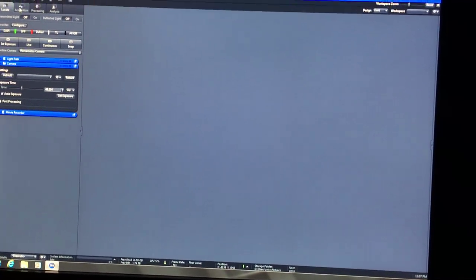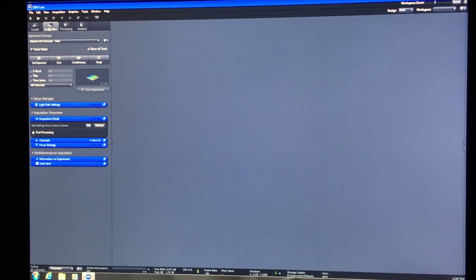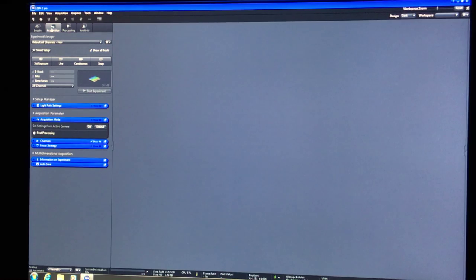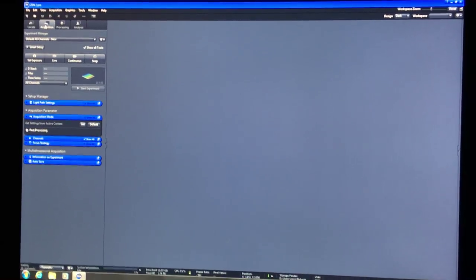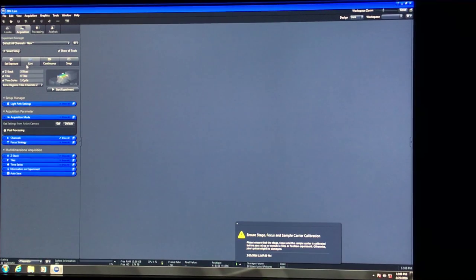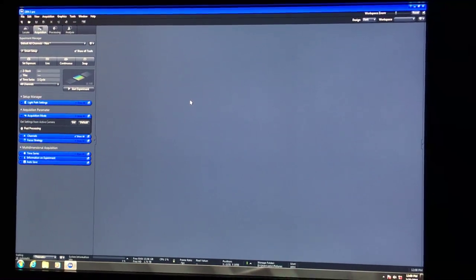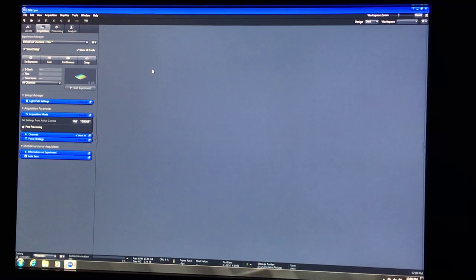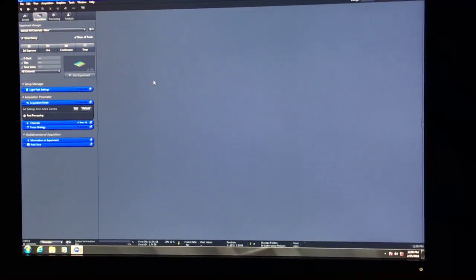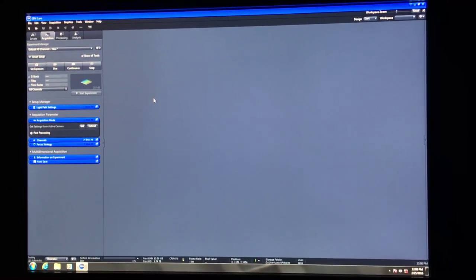Now go to acquisition—this is where the magic happens. The acquisition tab lets you program what you want the microscope to do for you. For today, we're going to learn how to do three-color imaging on a fluorescent sample, because that's the basic. If you know how to do that, everything else is just a matter of checking a checkbox. We may touch on time series since you're trying to do live cell, but at least by the end you should all be able to do three-color imaging.